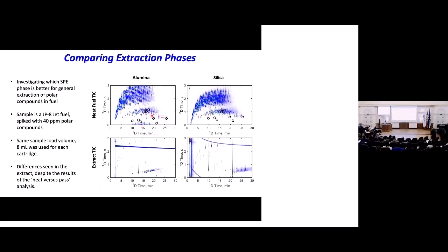And we'll mention off the top the 2D separations look a bit different, as we collected one of these further in the future and later went back to collect the other one, but the columns have been cut a little bit, and so we got a little bit of a different 2D separation, but we were able to match up everything in the end.